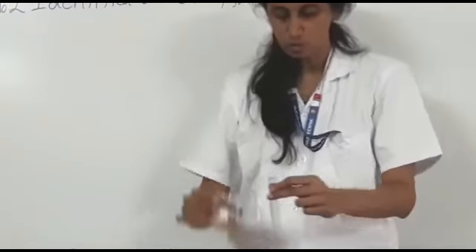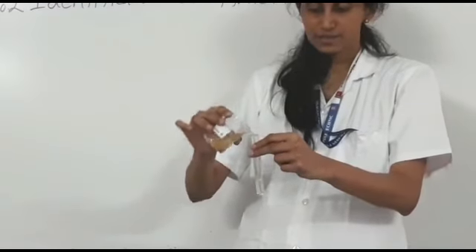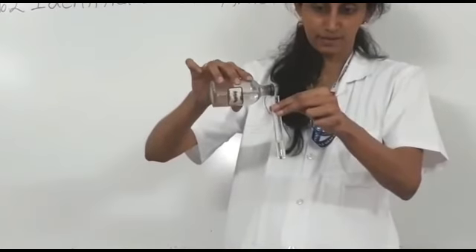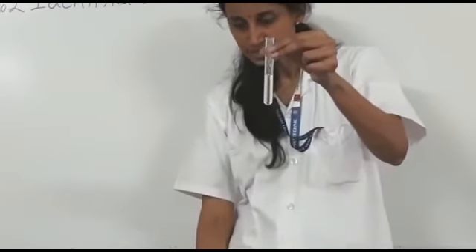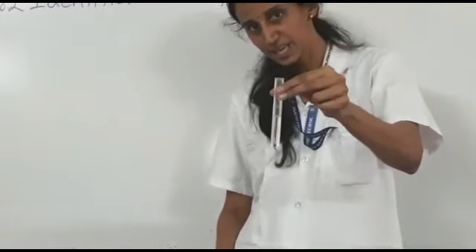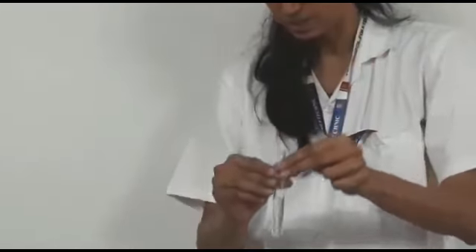Second test is OS plus AgNO3. What is the meaning of AgNO3? Silver nitrate. When we add it, there is no white precipitate. So what is the meaning of that? Halides, chloride, bromide, iodide are absent, as there is no PPT and no changes take place.